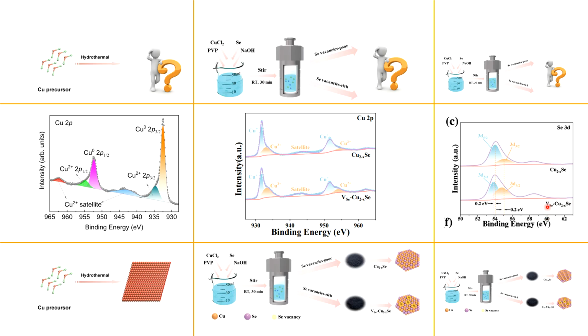As electron density extraction is less, it means selenium will have more electron density as compared to the other sample, because of the absence of neighboring selenium atoms, and as a result the binding energy shifts towards the lower side because the oxidation state gets decreased because of the vacancies. So this is clearly shown in the XPS spectra.